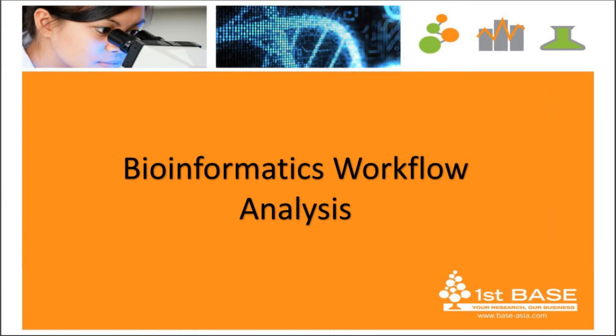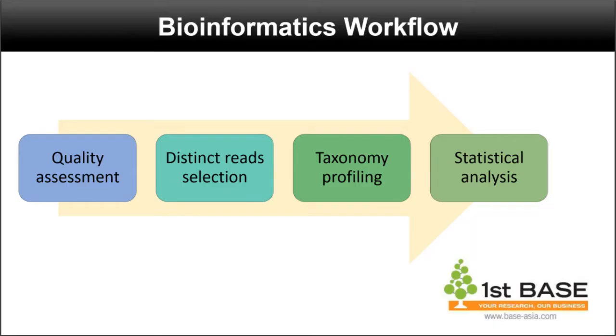Just a quick introduction to bioinformatics analysis. Bioinformatics analysis is the analysis of biological data using different computational tools, and often requires programming languages as well. At the end of the analysis, we can obtain statistics and graphical results for better presentation of our analysis. So now let's start with the bioinformatics analysis workflow for Amplicon sequencing.